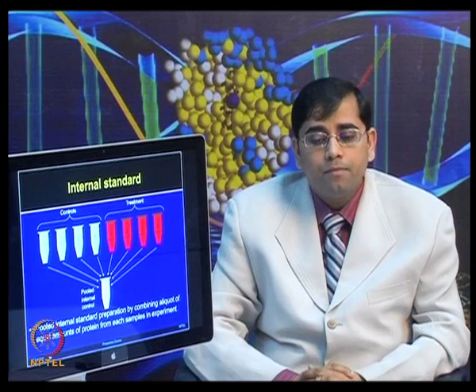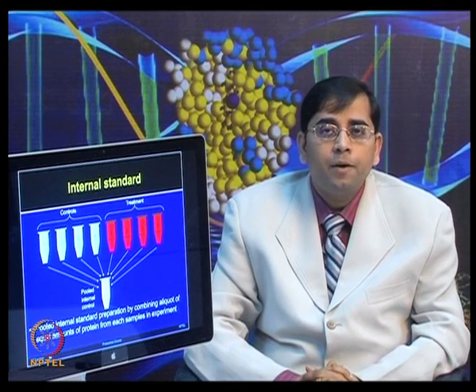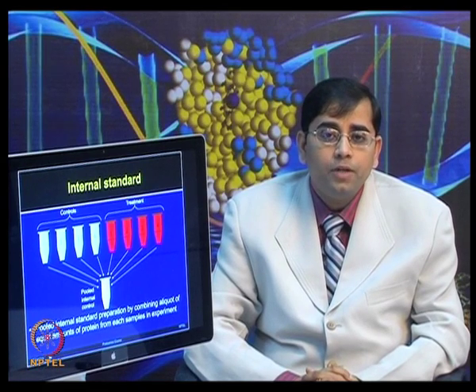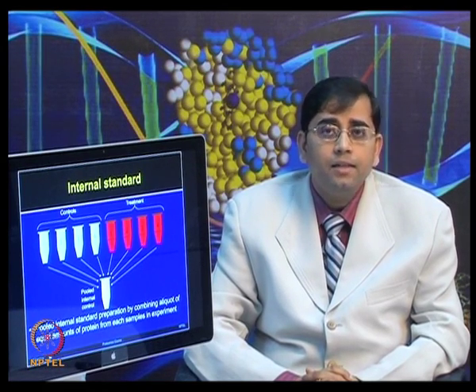So, this pooled standard preparation can be performed by combining aliquots of equal amount of protein from each sample in the given experiment.